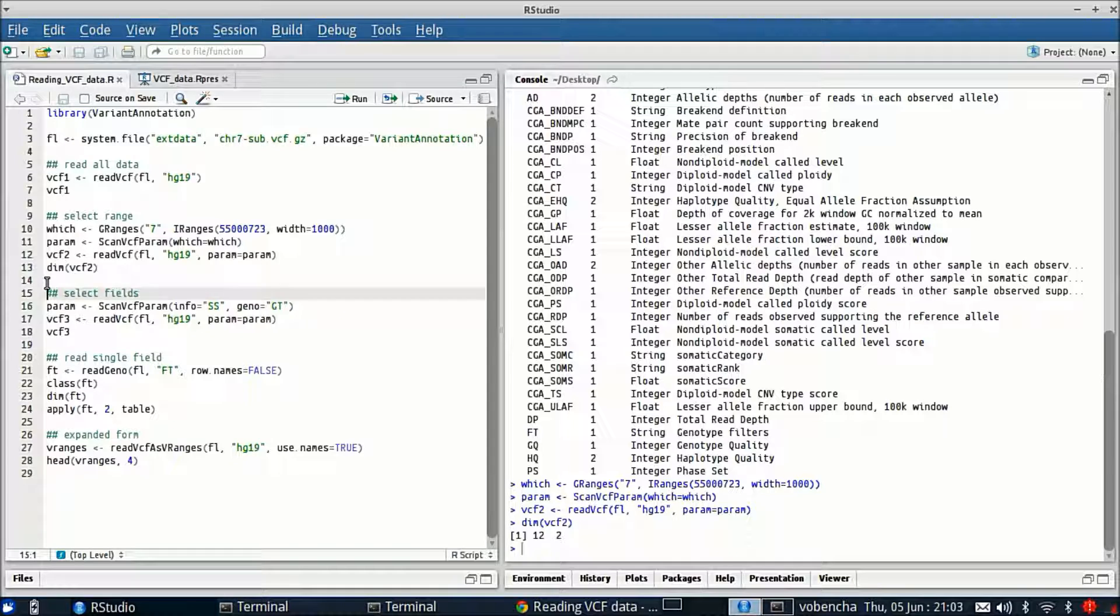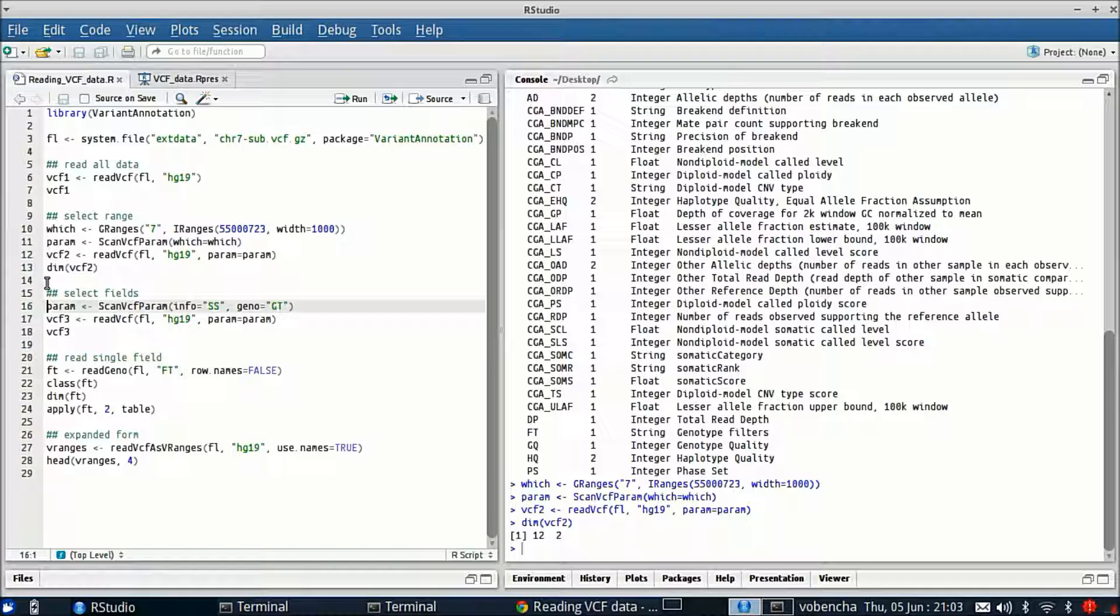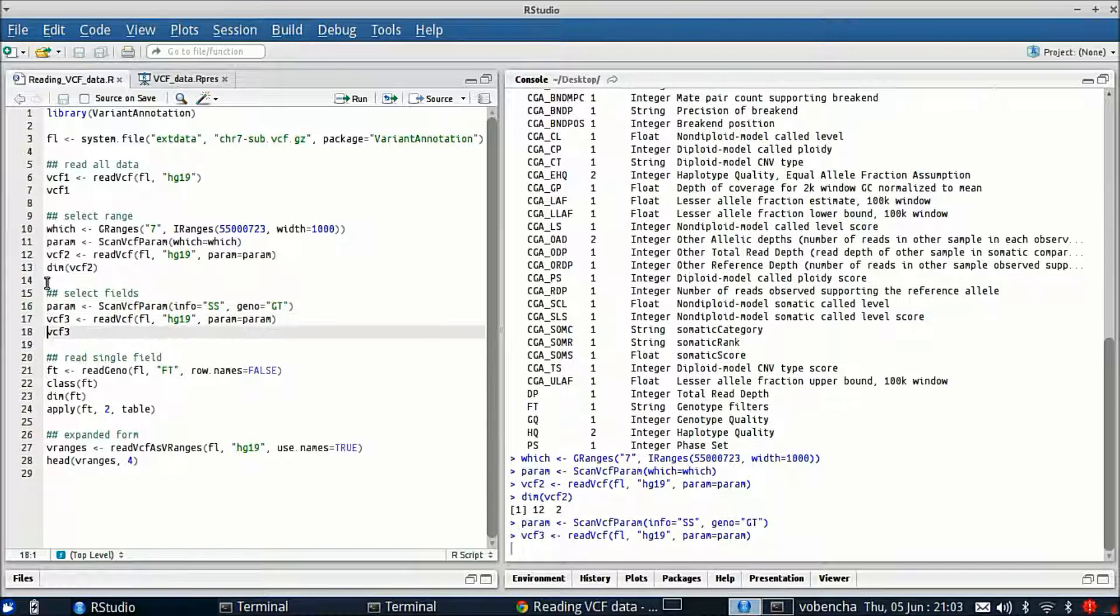Similarly we can do the same thing with fields. Again we would create this scanVCFparam and specify an info field and specify a geno field, then give that to ReadVCF.